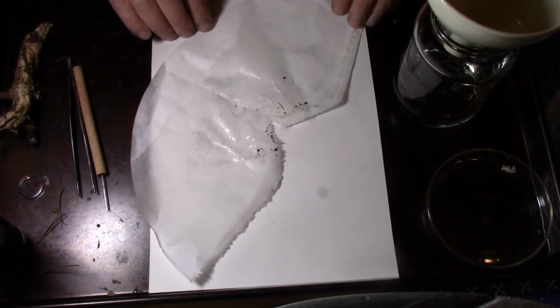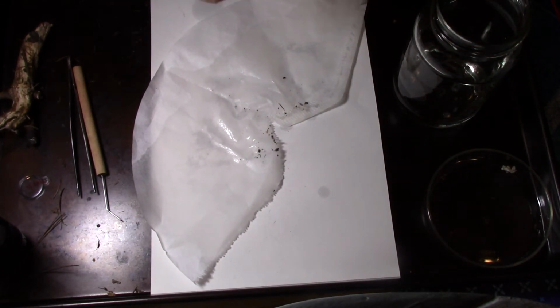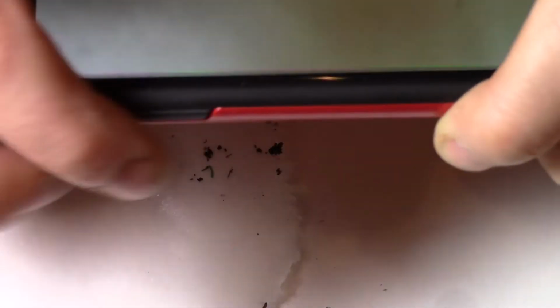So if we were in class, I would put this under a dissecting scope and look at what I found under the dissecting scope. But I'm going to try here to use my homemade microscope and see what I can find. So far, it was pretty good, so I'm going to zoom in a little and see what we can see.